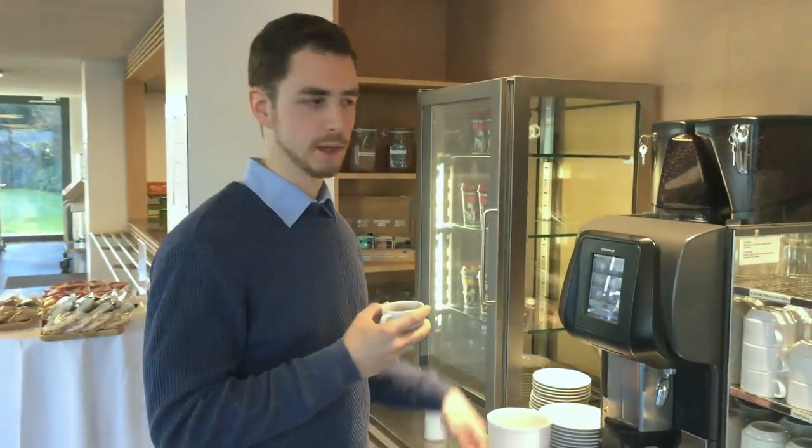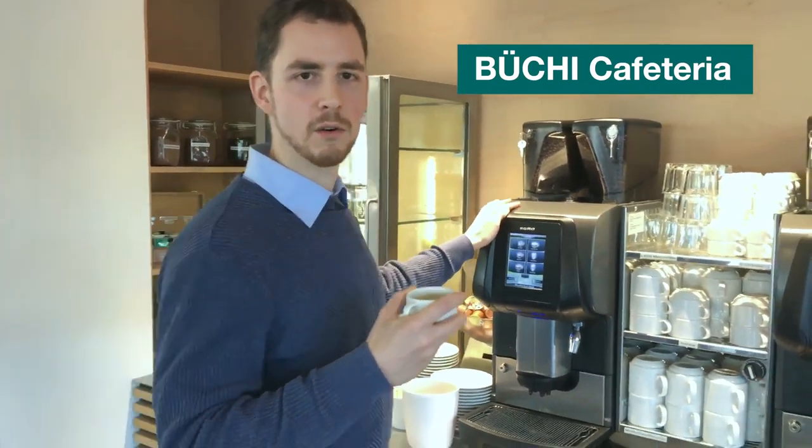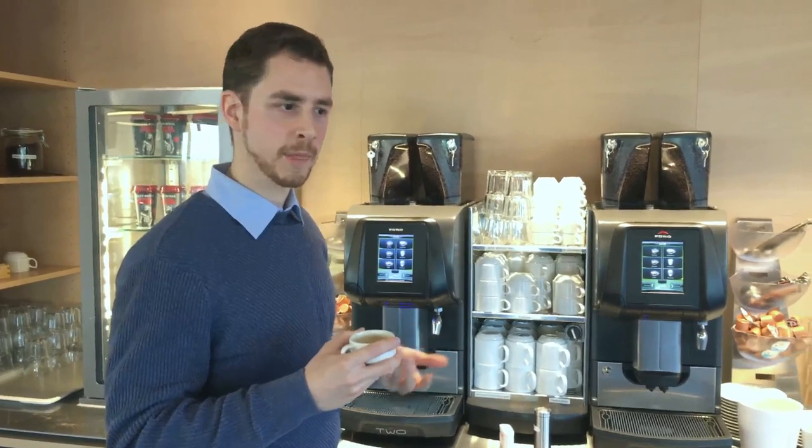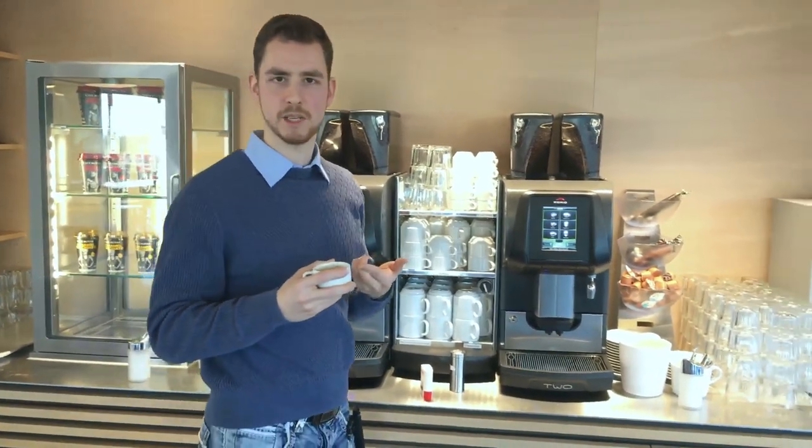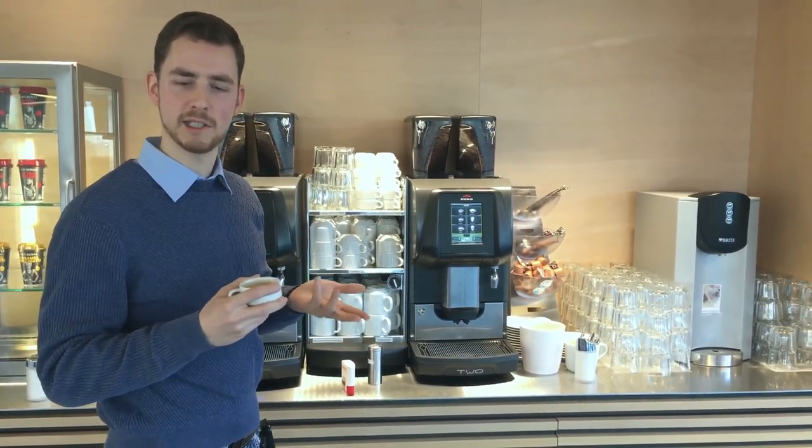What's the difference between this coffee machine and the chromatography system? The answer is I don't need to know all the details about the compound in this coffee extract, you just need to have a good flavor. But if this would be a synthesized mixture or an extract for which I spent several hours, then I definitely want to know what's inside.